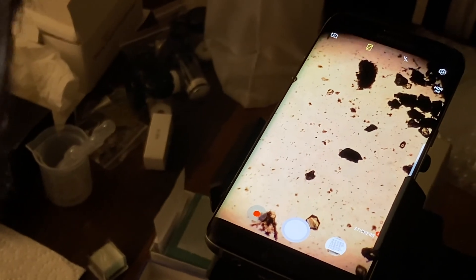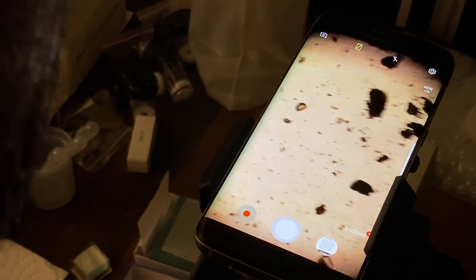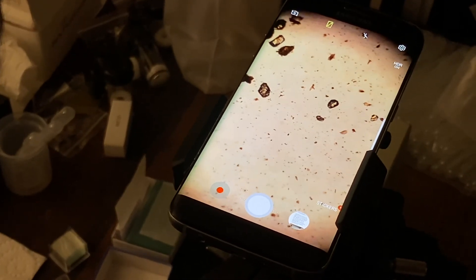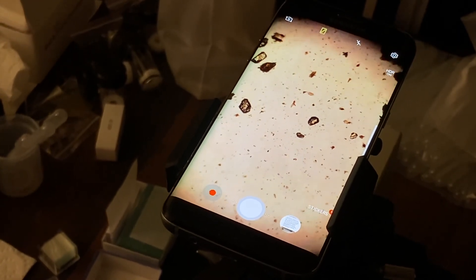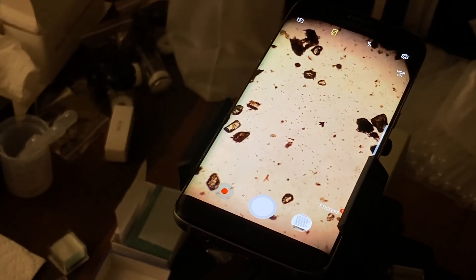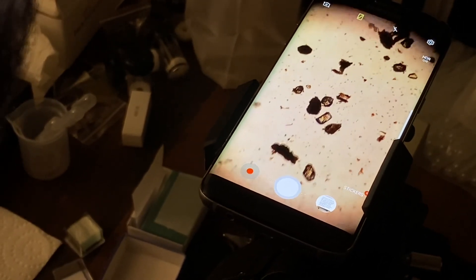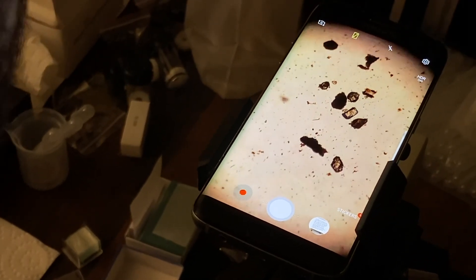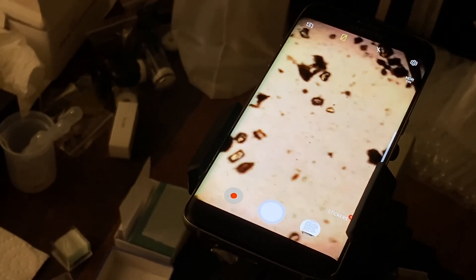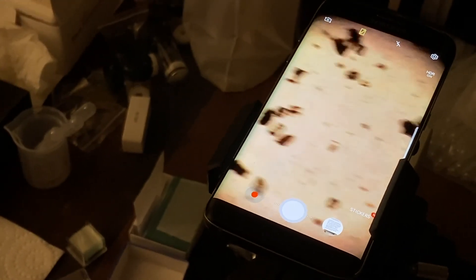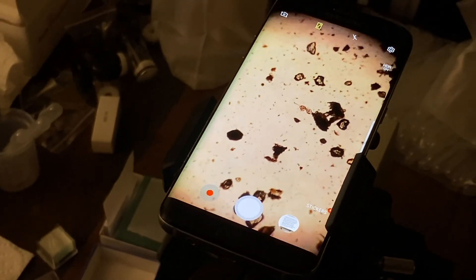So we have a ciliate moving around a piece of our biochar — see it swimming around, scooping things up. You don't want to see an overabundance of protozoa or ciliates that move around real fast like that; if you see a lot of them, it's likely your soil has gone anaerobic. But we want to see a few of them here. They're an important part of the soil food web. They eat bacteria, and when they excrete, those minerals and organic matter that the bacteria were breaking down become available to plants.